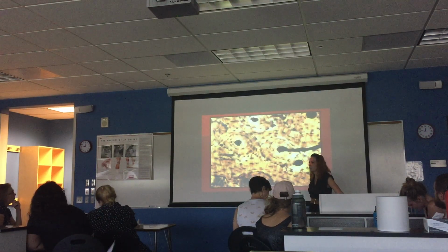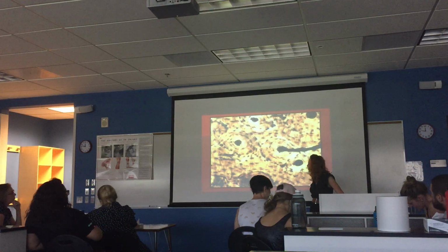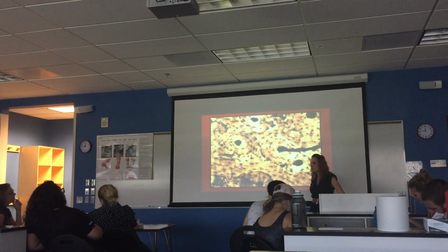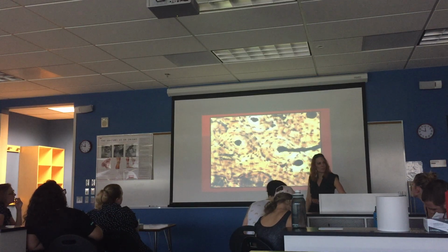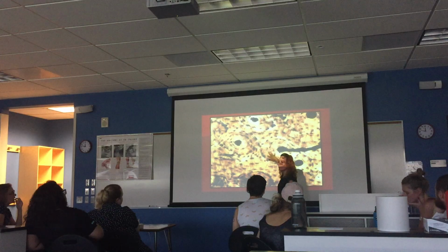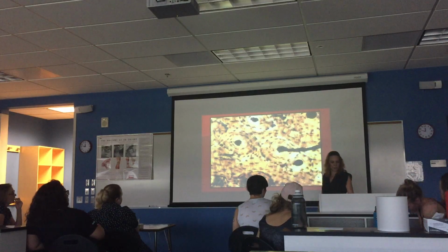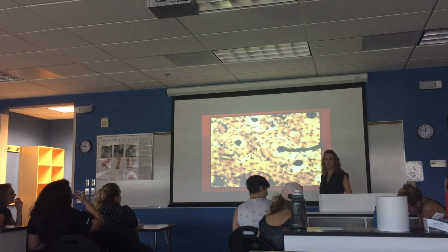Easiest slide ever on the planet to identify, in my opinion, bone or osseous tissue. Don't spend any time on this. Look at it and move on. We're coming back to it in chapters 6 and 7, okay? We're going to have little osteocytes living in the lacuna. But we'll name all of these parts when we get to those chapters, so don't get too hung up on it. Just be able to identify it as a connective tissue called bone.